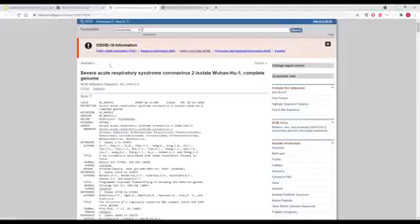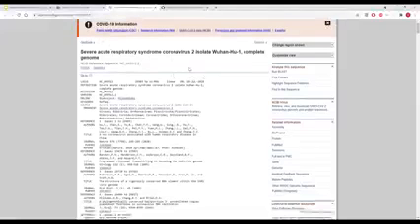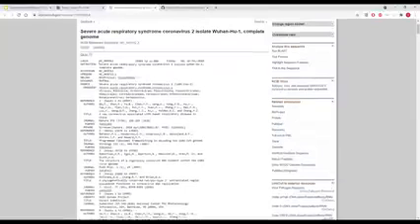And here we go. Here's the Genbank entry for COVID-19. The whole script is attached to it. The locus is basically the name of this gene, and in this case it's the accession number, the unique ID number of your gene. It is 29,903 base pairs long, and it contains viral RNA, which is expected because it's a virus.